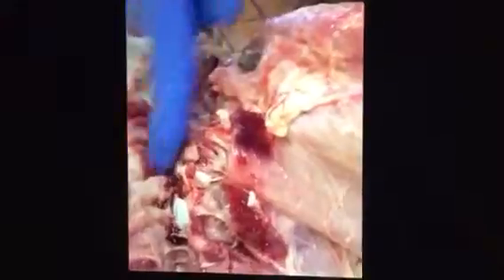I'll just cut this. So all these nerves, it's not as obvious as with the brachial plexus, but I did cut through all these nerves right here. These are all the lumbosacral plexus.